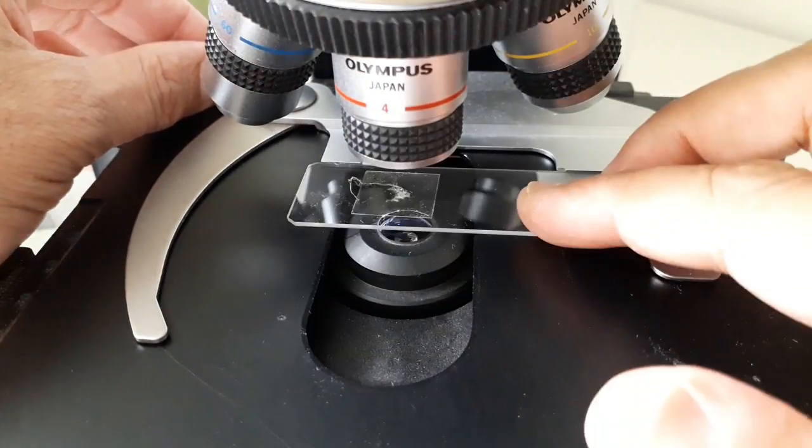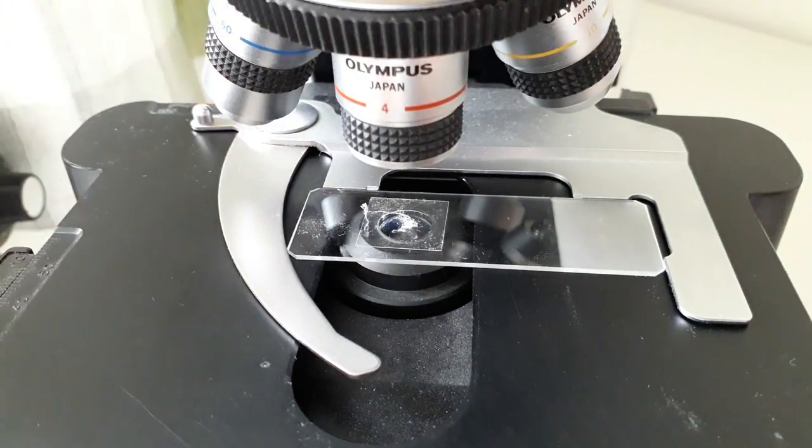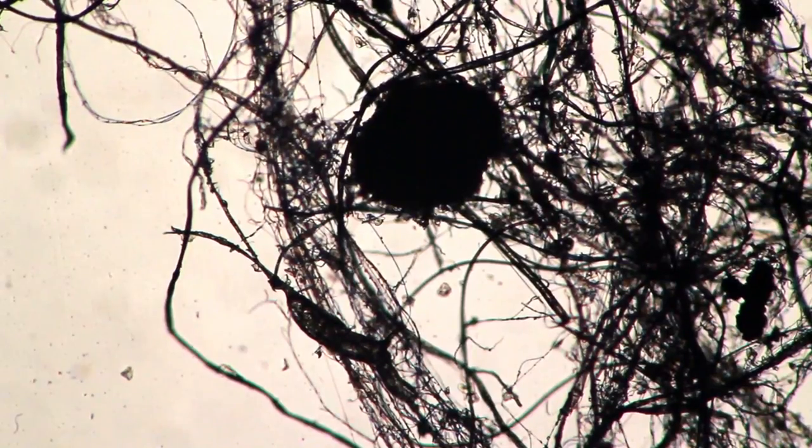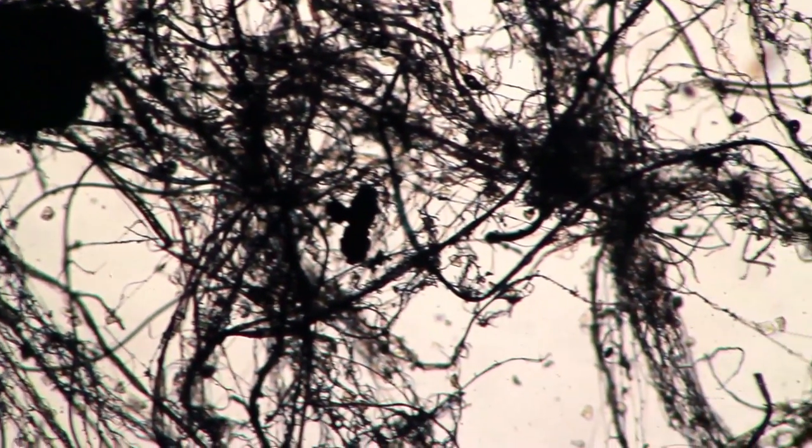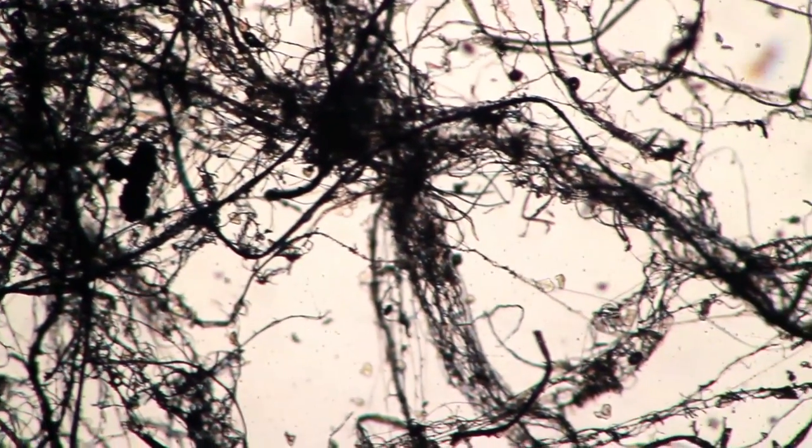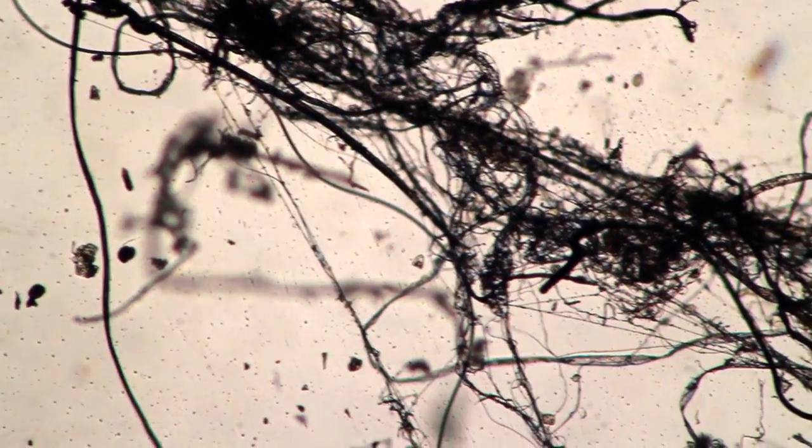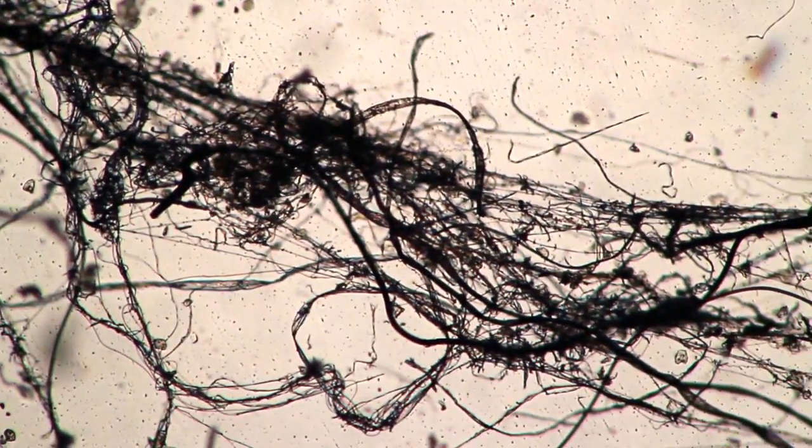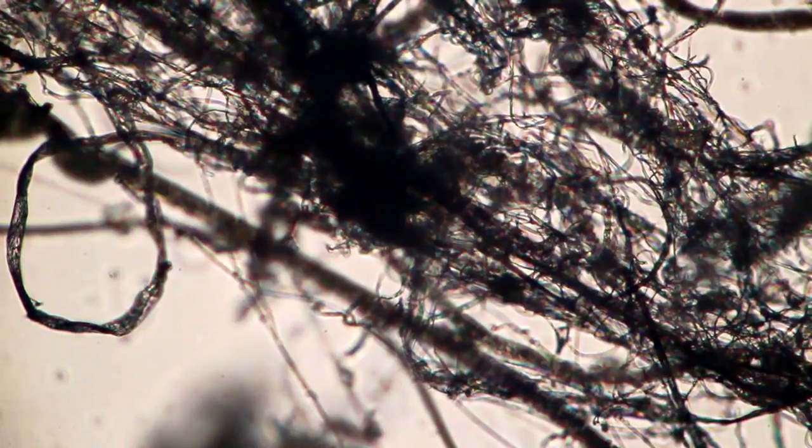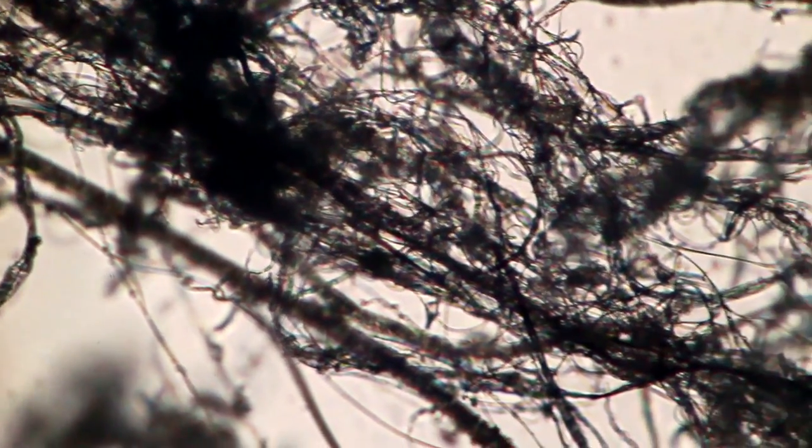Here it is. It goes under the microscope and I was about to measure out the thickness, but then I discovered it's a total mess. Look at this - I could not distinguish the spider's silk from the dust. There are so many textile fibers from clothing. I have no idea what I'm seeing here and in any case it's impossible to make any proper measurements.